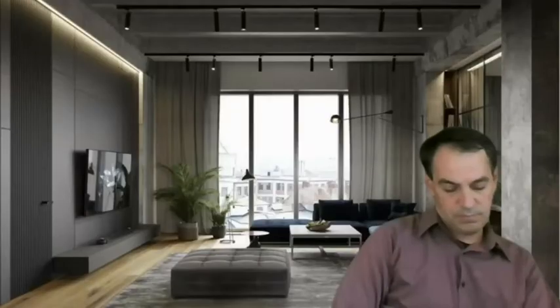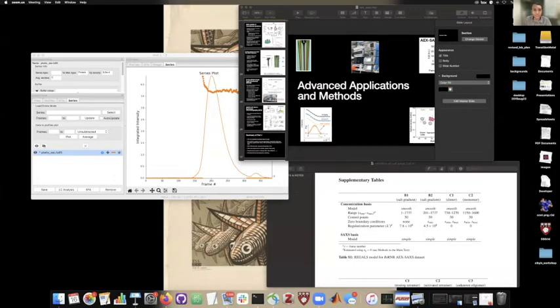Okay, yeah. So I think what I'll do is show these advanced applications really quick, and then I'm going to go through a little bit of the REGALS method, because I think it will be interesting to this audience, and then show a quick demo of REGALS for one anion exchange data set, just to make it more concrete. Okay, so let me share. Oh boy, I got the whole thing. Okay.